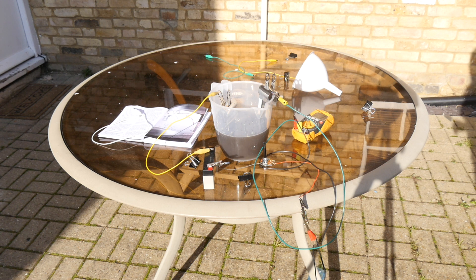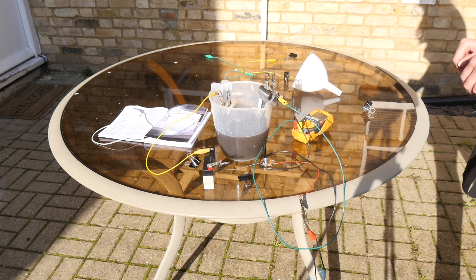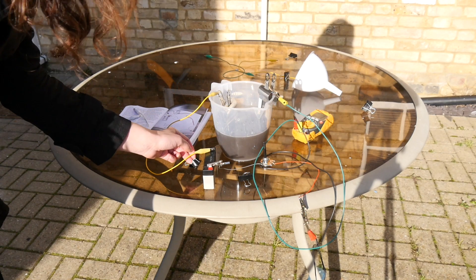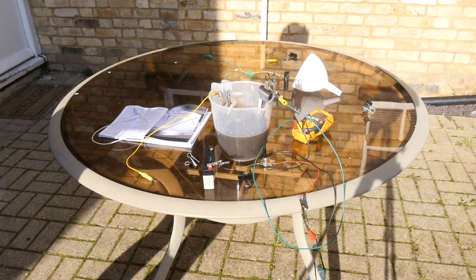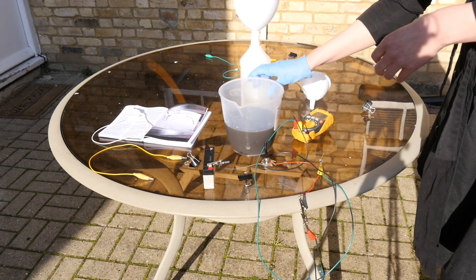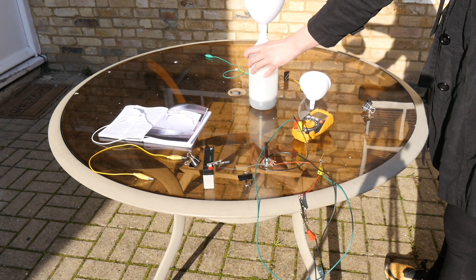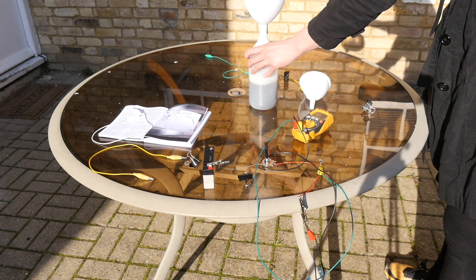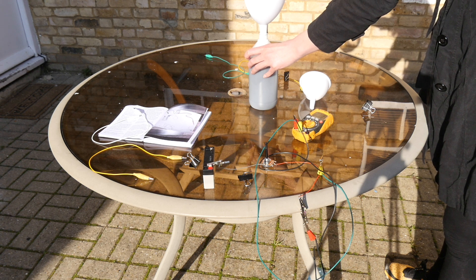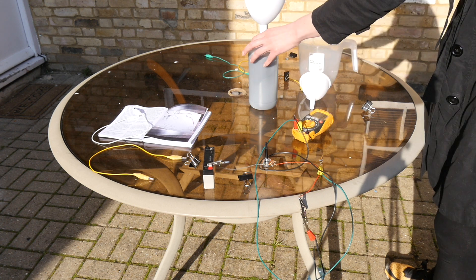This has now been cooking for about 25 minutes, so I'm going to disconnect the circuit. I'll turn this to off and then unplug one of the battery cables. That's disconnected now. I'm going to pour the fixer back into the fixer bottle, doing this quite carefully so I don't spill any on the table, and away from the battery as well.